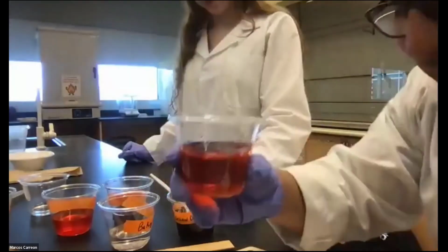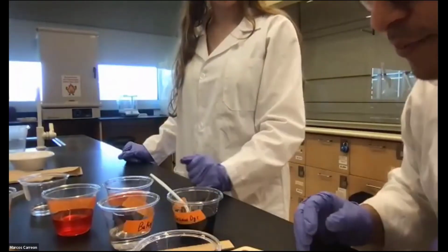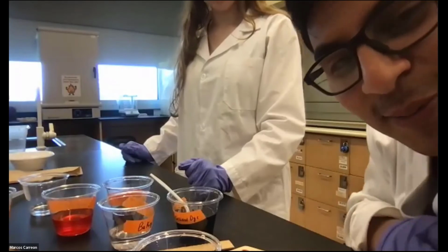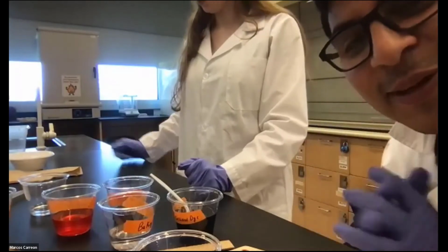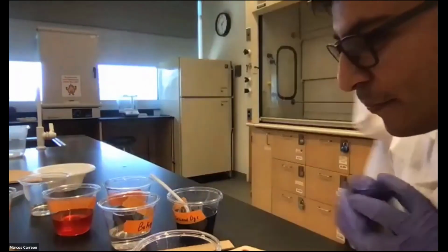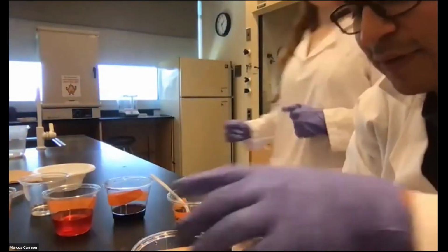All right, so what we can do something else with this, we can probably add some baking soda and see what happens. This is not part of the procedure, but I think it's kind of cool to try new things and see what happens, just so we can see the colors a little bit better. So we do have this baking soda.